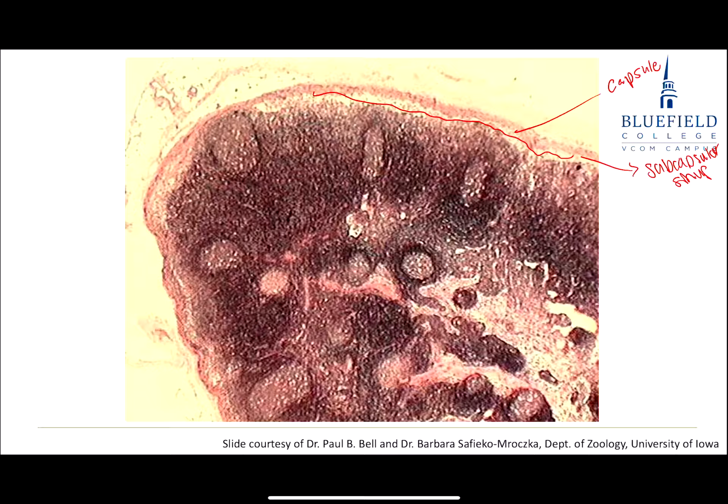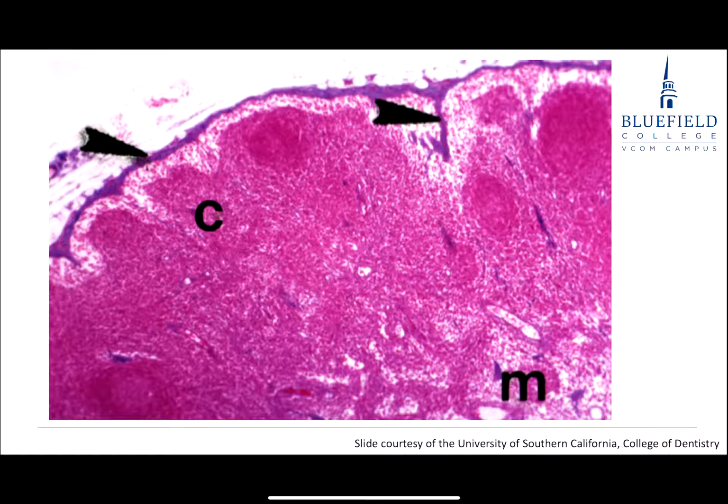All right, if I take a look here, once again, maybe not as active, but I see a nodule right here. Maybe a slight hint of a germinal center in the middle. Here's a nodule out here without a germinal center. So I'm looking at a lymphatic organ.